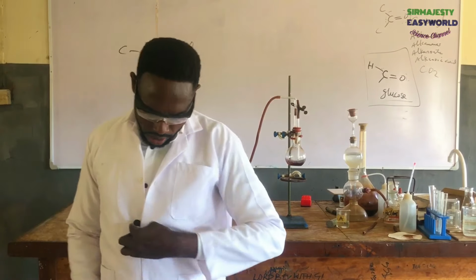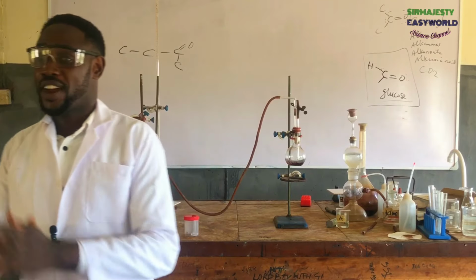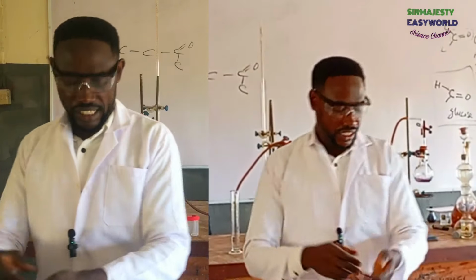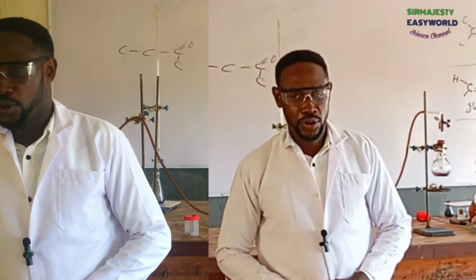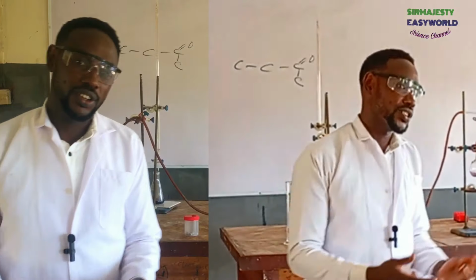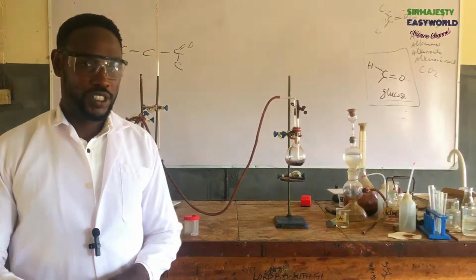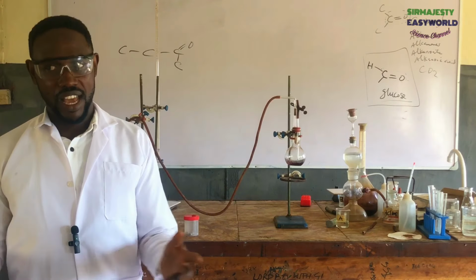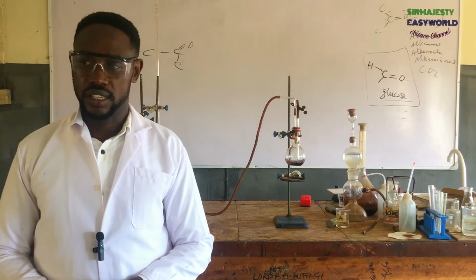Okay. So welcome. Today I'll be trying to see two gases that, when you mix together, will spontaneously ignite. We want to see the oxidizing power of the halogens. Halogens are powerful oxidizing agents such that they can spontaneously ignite some gases. Some gases spontaneously ignite in some of the halogens, like chlorine and fluorine. They are very, very reactive and highly electronegative.